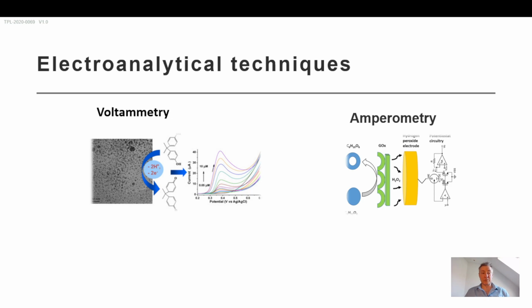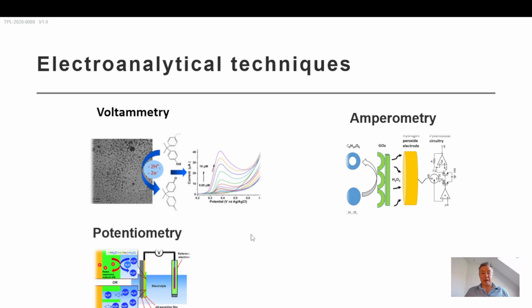Amperometry was simple enough to implement some decades ago, but these days with modern electronics, you really don't need such a simple waveform, but we will discuss it. Potentiometry we will discuss today. Potentiometry is also extremely widely used in our world. The most measured chemical parameter is probably pH, and most pH meters in a laboratory are potentiometric in nature. So it is something that a lot of scientists and engineers are familiar with, or at least use, whenever they make a pH measurement.